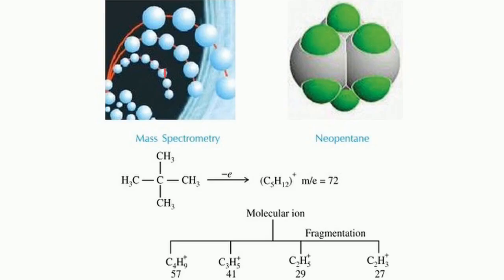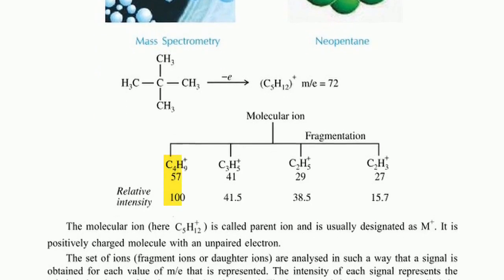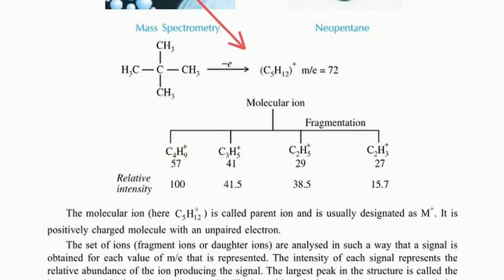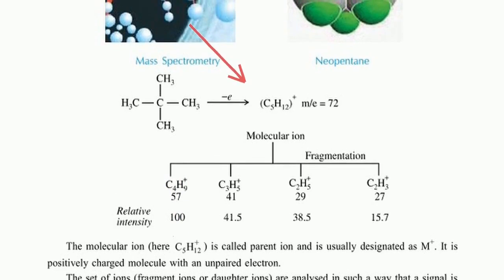energy. This diagram illustrates the flaw. Hitting a complex molecule with high energy shatters it. The neopentane molecule breaks into fragment peaks at 57, 41, and 29. The data lacks the parent molecular ion peak, the crucial point needed to identify the intact molecule.